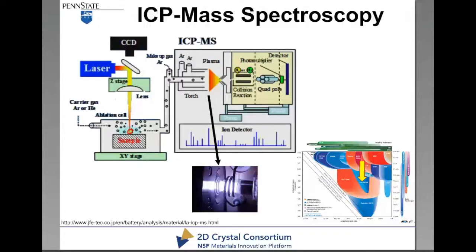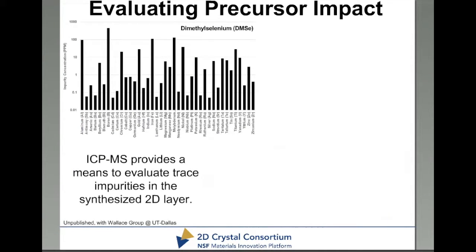However, Raman, XPS, and the various other characterization techniques typically require on the order of percent level impurities to be able to be identified using your more traditional characterization techniques. And a lot of times you can get up to a percent or something like that and not even really see it using things like Raman, PL, etc.